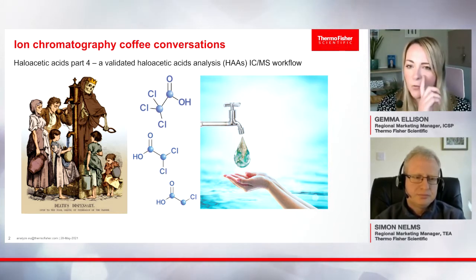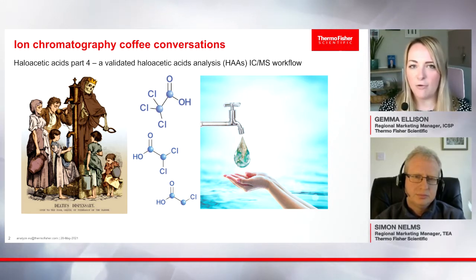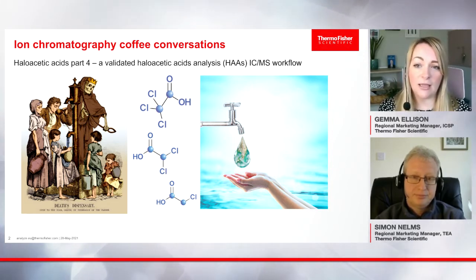Exactly. So, however, I do appreciate that ICMS does sound a little bit scary or complex, and especially if you're new to this technique, it might sound very complicated. And it isn't, basically. It doesn't have to be. Lots of the features of the ICMS are automated. You don't even need to make up your mobile phase, the eluent. It actually is generated online for you within the system. So you just add deionized water. So most of the scary stuff is actually taken care of by the system.